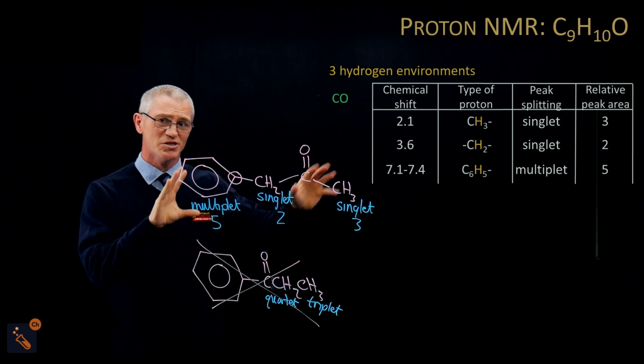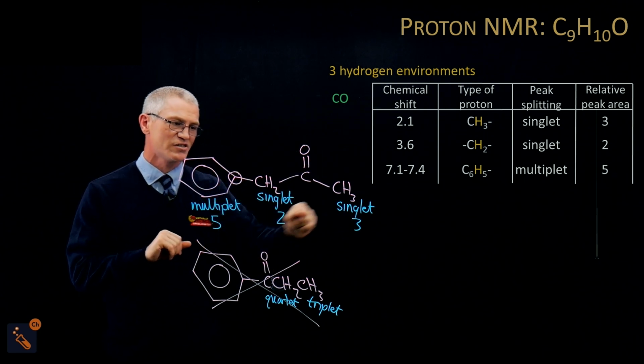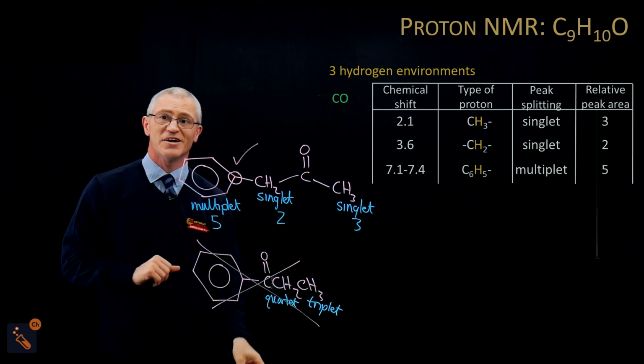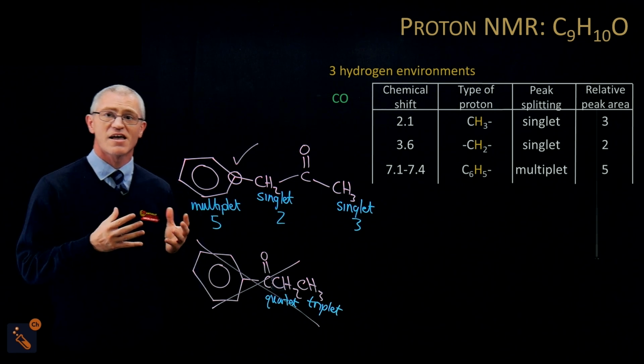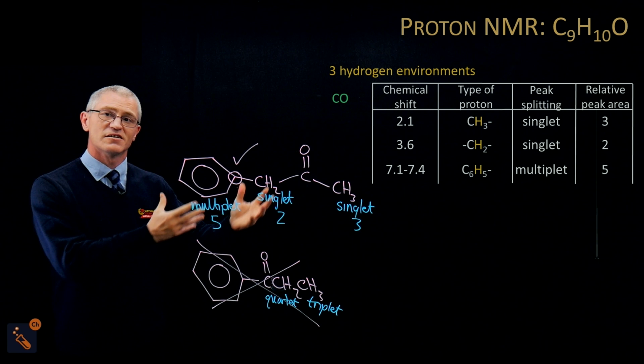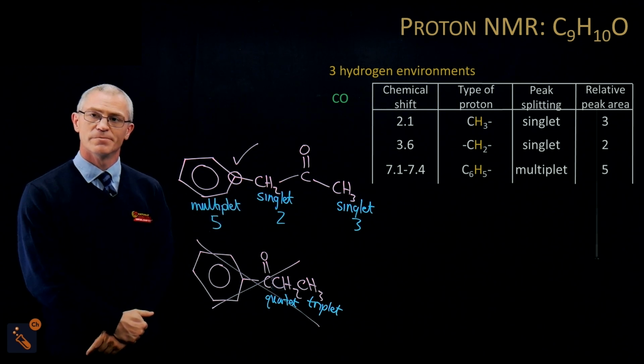I drew this, thought it might be this, then I drew it and went through and checked it was right. So I know full well that this one is correct. And so that is how you use benzene and you find out you've got a ketone.